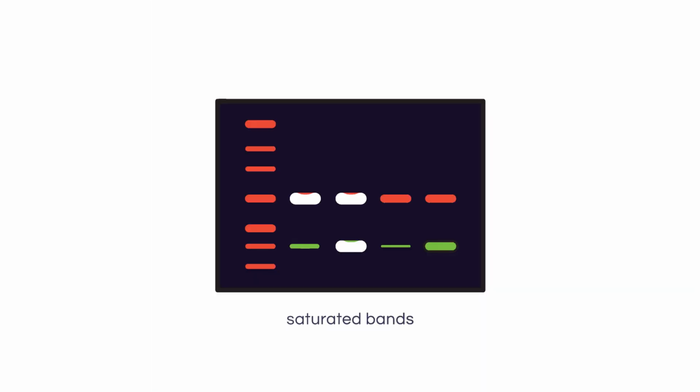Of course, if you are going to quantify your image, then there are a couple of additional things that you're going to want to check before you proceed. The first is to verify that you don't have any signal saturation. As we discussed in the previous course about detection of your signals, this can occur when the signal from one or more of the bands, or a part of those bands, is stronger than the highest level that your detection system can possibly measure.